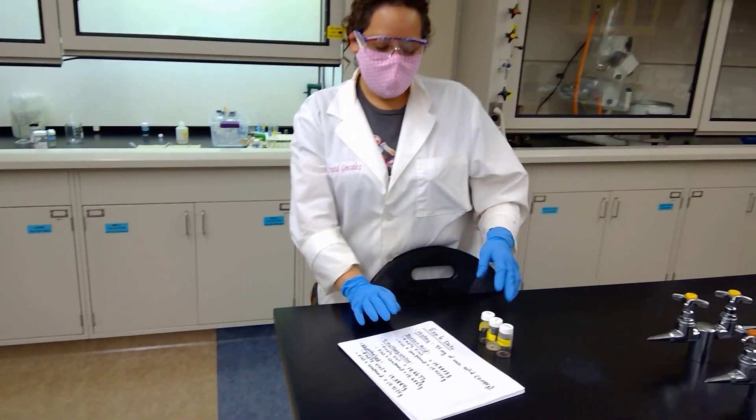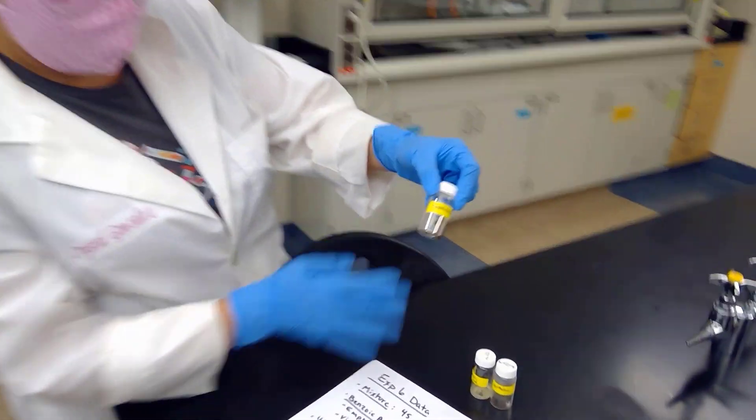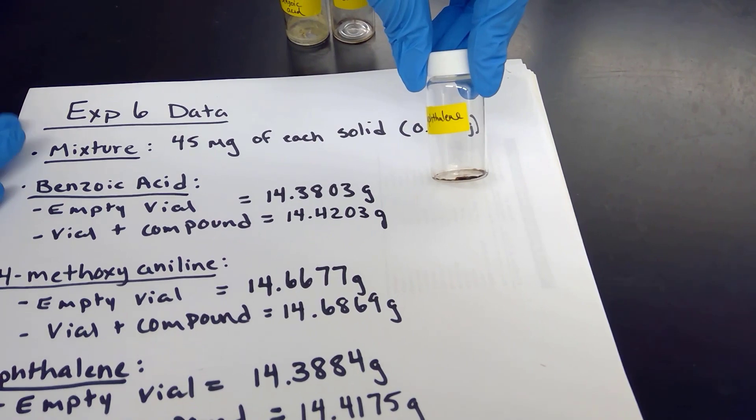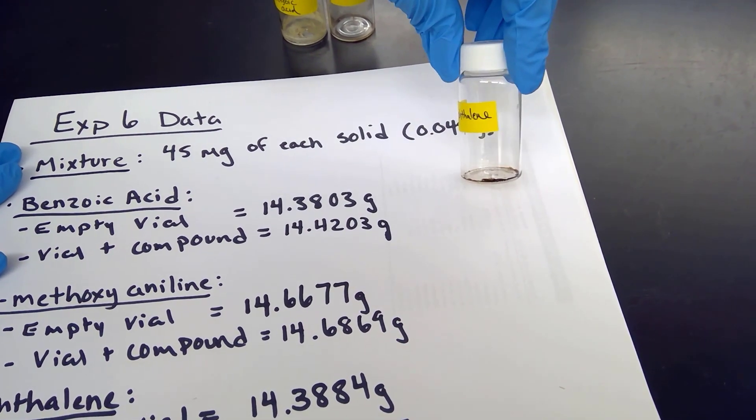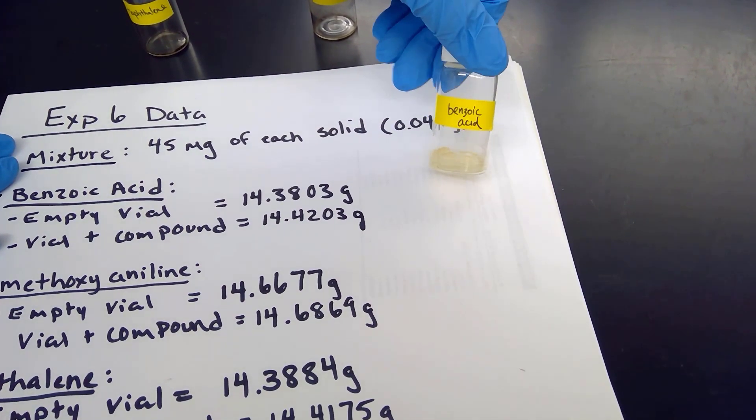Students, we have our samples here. We have evaporated all three samples, and I just want to show you what they look like. So I'm going to go ahead and place them on top of this white sheet of paper here. And so if you see, our naphthalene here is somewhat of a dark solid. And then we have our benzoic acid, which is a whitish solid.